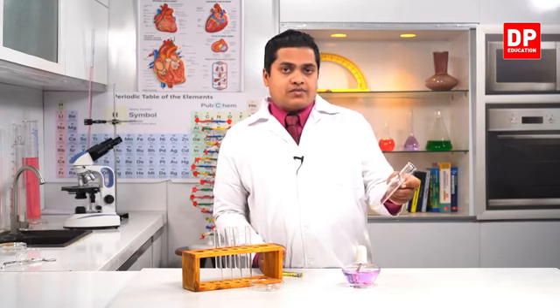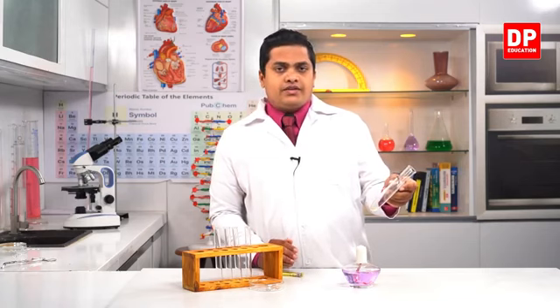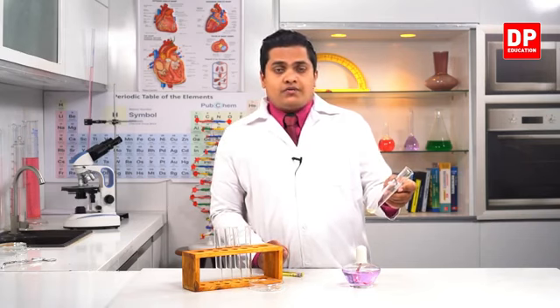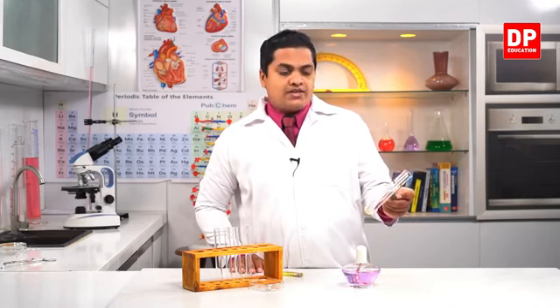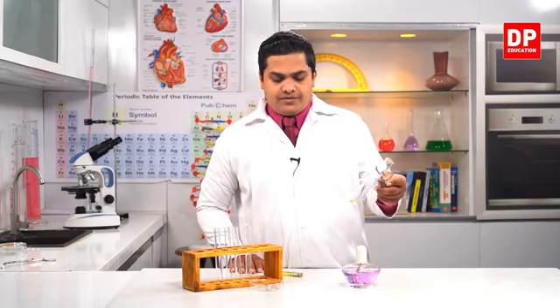After that I'm going to explain what kind of change occurred here. Actually, you know that this is a physical change, but I'm going to specially explain the term which is given for each change of state. So I'll keep this boiling tube in a position so that it will cool gradually.